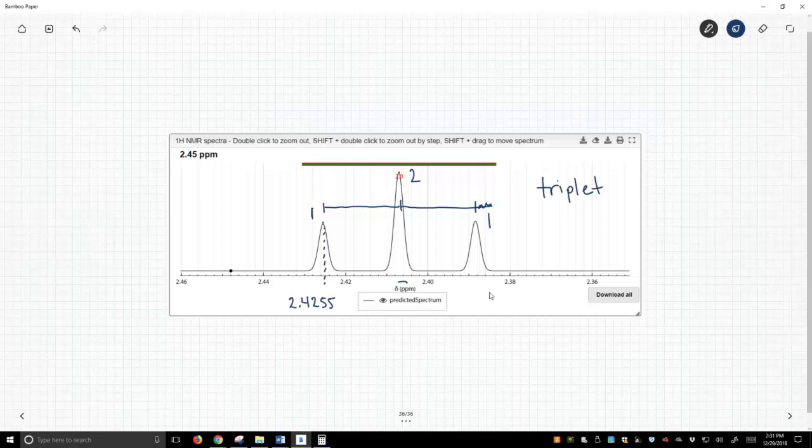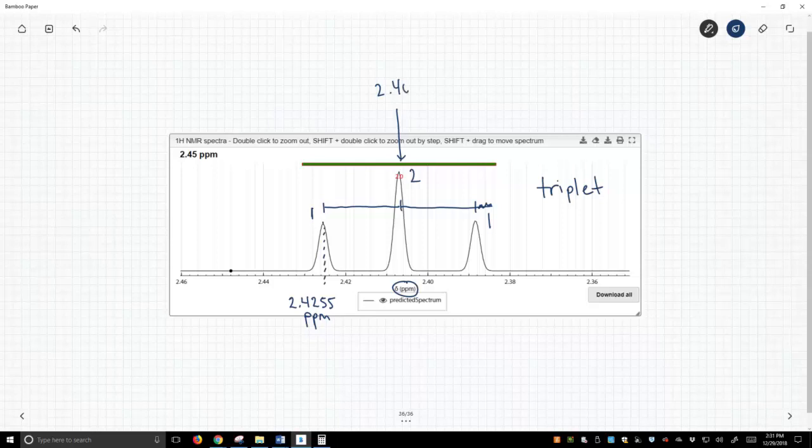And our x-axis is in ppm, and I felt the best value for this is about 2.407 ppm, and I thought this value was right about 2.3885 ppm.